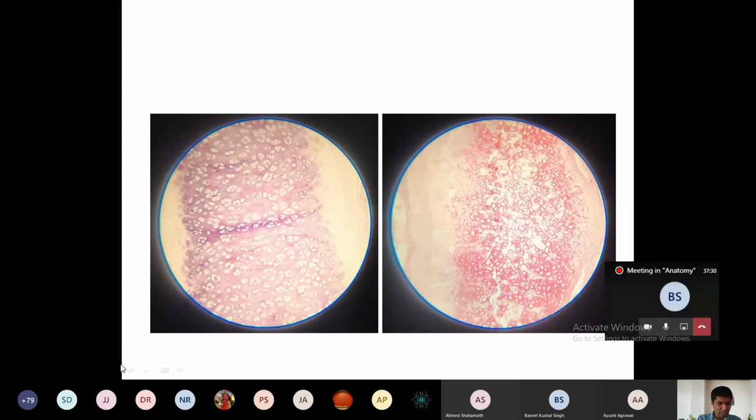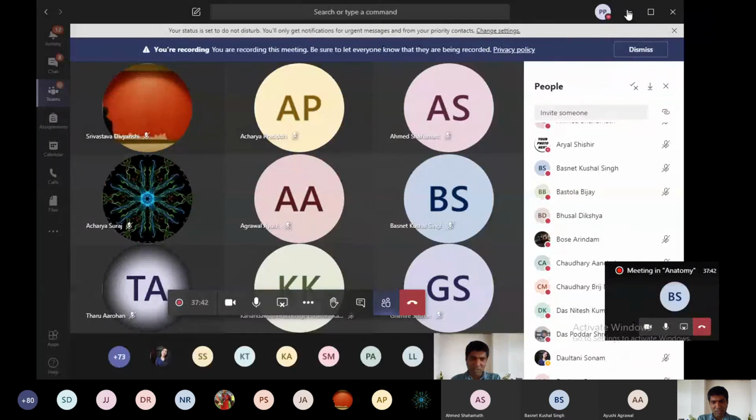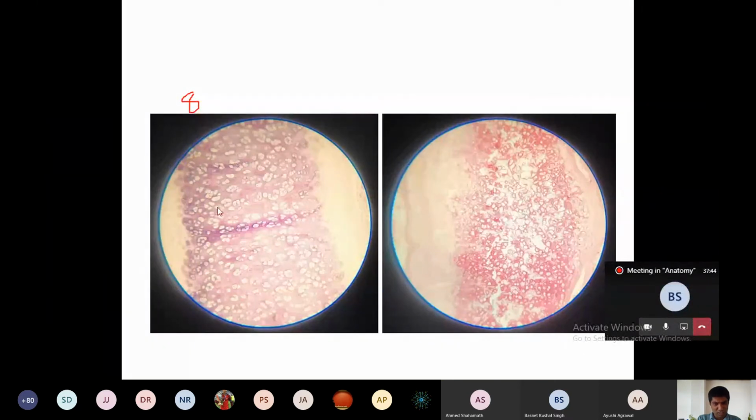Now come to number 8, and who was there in the queue? In the queue, who are there? Yes, sir. Yes, hyaline cartilage. Yes, Diksha. Okay, hyaline cartilage. This one is the hyaline cartilage. Good.